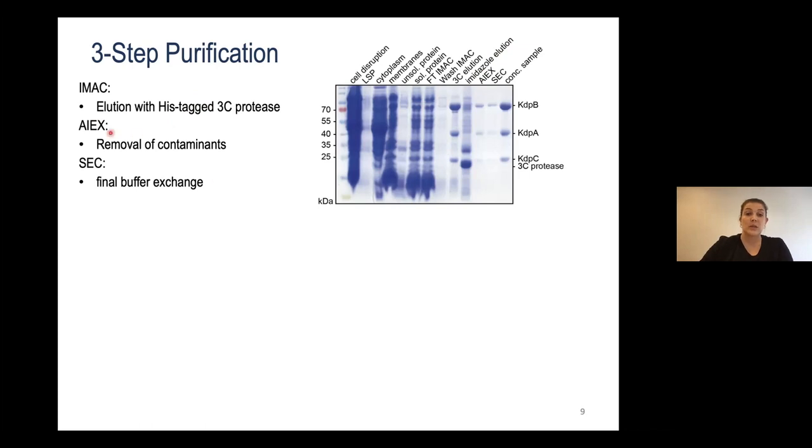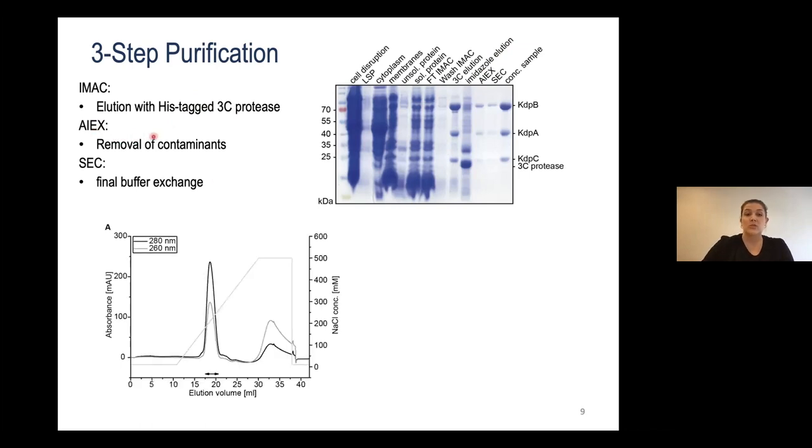The next step was an ion-exchange chromatography to remove additional contaminants. The isoelectric point of KDPF-ABC is around 7.5, so I decided to do that at pH 8 with an anion exchanger - positively charged resin, a Q-sepharose, for example. I eluted with a sodium chloride gradient between 10 and then 500 millimolar. As you can see, I nicely separate the protein, which is here, from all contaminants that are high in 260 absorbance that otherwise would be very hard to get rid of.